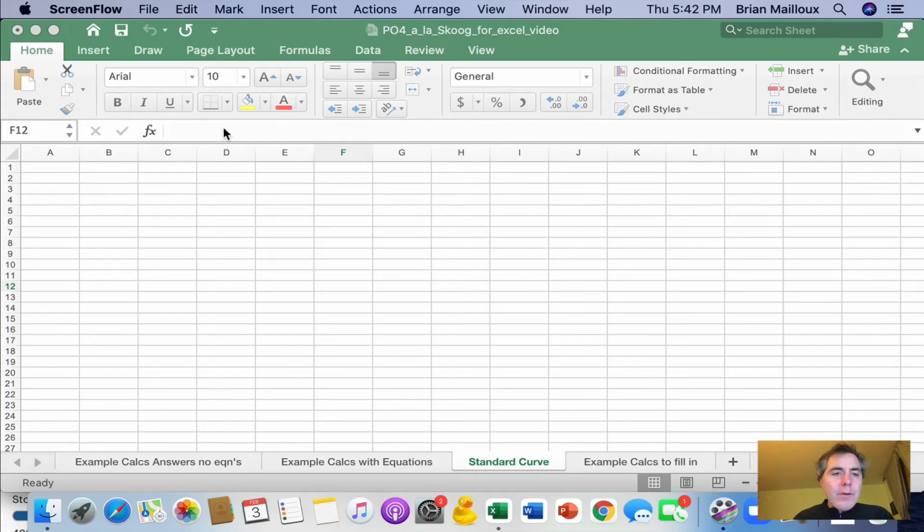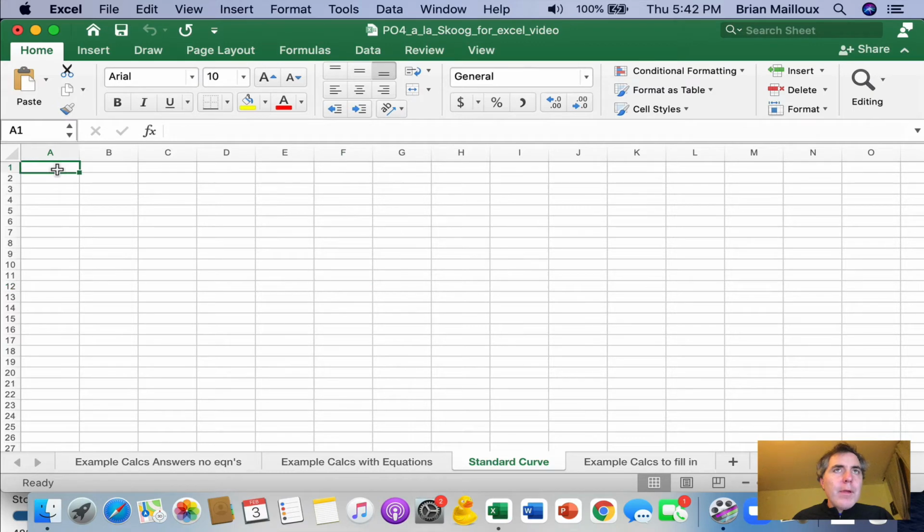Today, we're going to make an Excel sheet that we'll use a couple of times on how to analyze standards. This is how I normally do it. So here's what I would do. I'm going to start by just putting in some information for when you do an analysis.